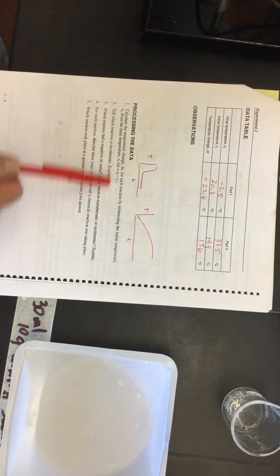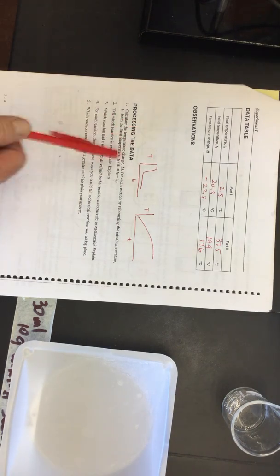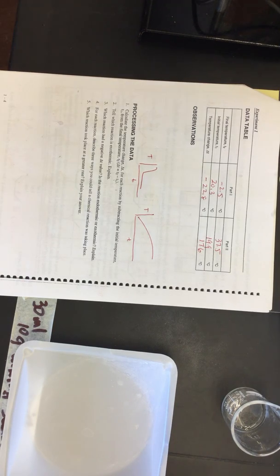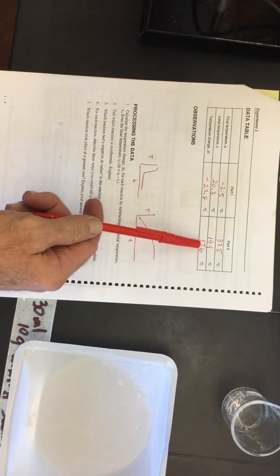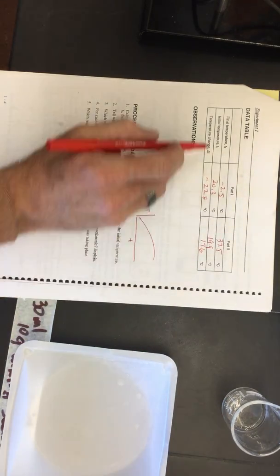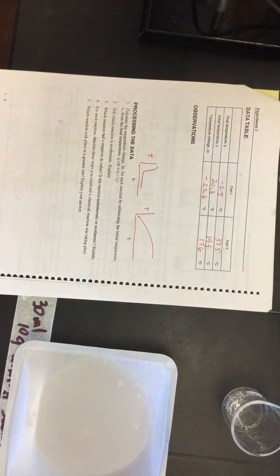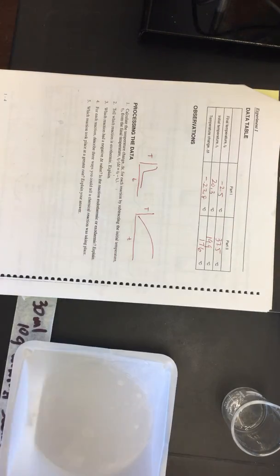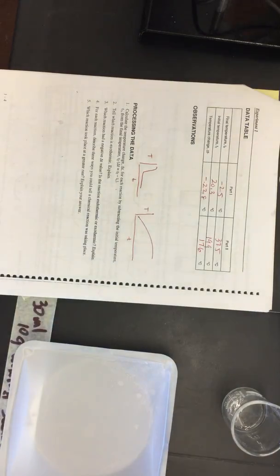So this says calculate the delta T. We calculated that, and we subtracted those two. So we've already done that. Which reaction of these is exothermic? Which one is releasing heat? Well, remember the first one got colder, and this is the second one, and we're taking a look at the delta T, the change in temperature. This dropped 22 degrees. This increased by 18 degrees. So this is the one that increased right here. Which is exothermic, which releases heat? This is the one that releases heat because this is the one that increases in temperature.